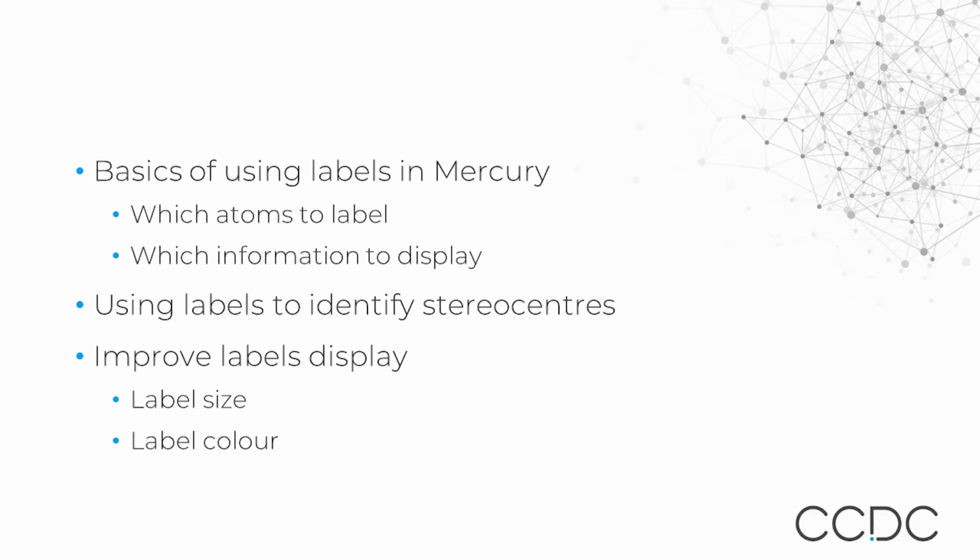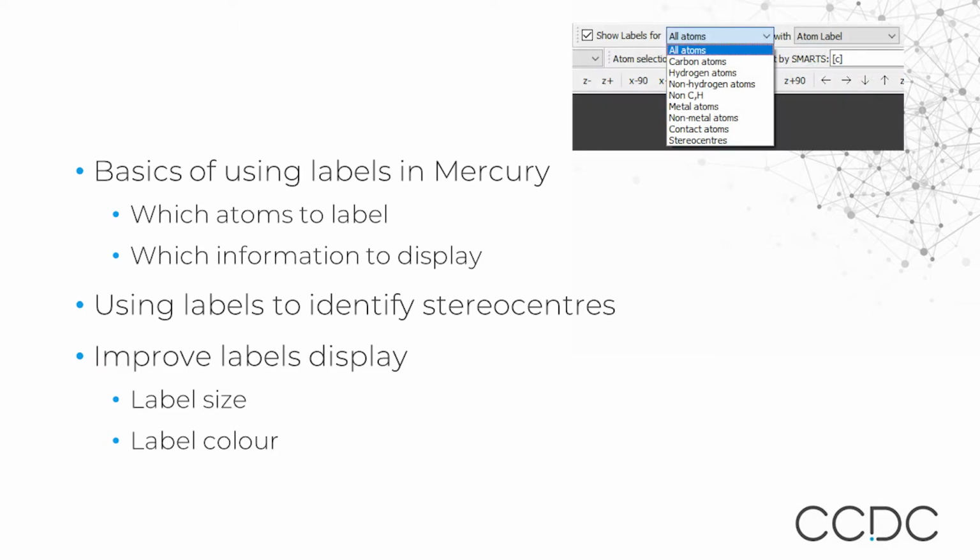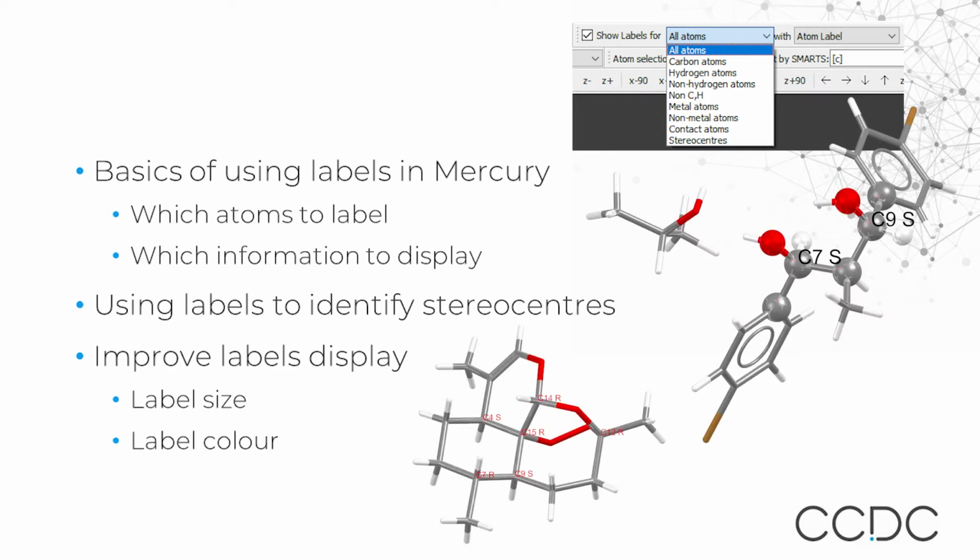Welcome to this how-to tutorial on using labels with CCDC's visualization software Mercury. In this video, we will see how to apply a range of different labels, how to select the information to display, and how to edit their appearance. Let's get started.